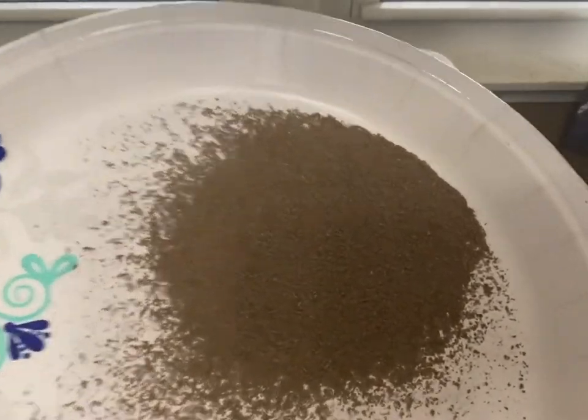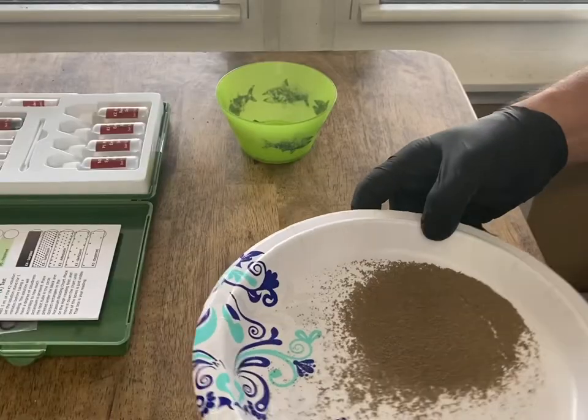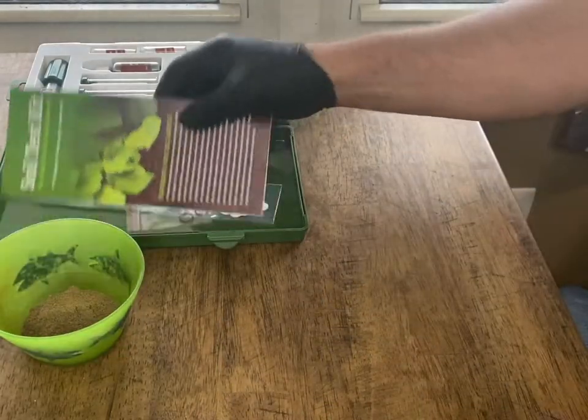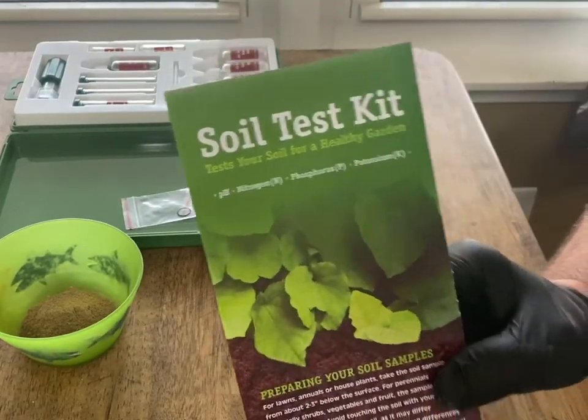Look at that — that's pretty fine stuff. I'm going to pour it back into here. Let's read some directions from the soil test kit.